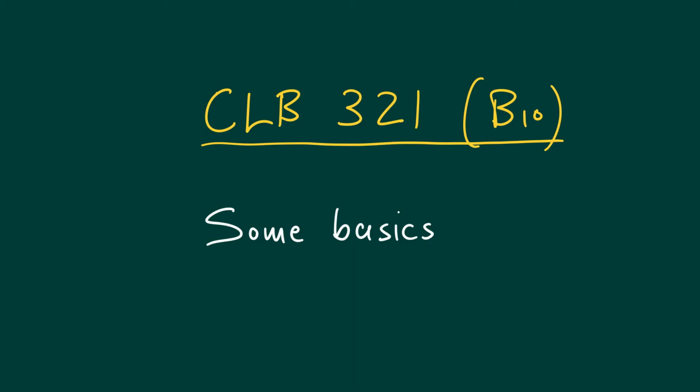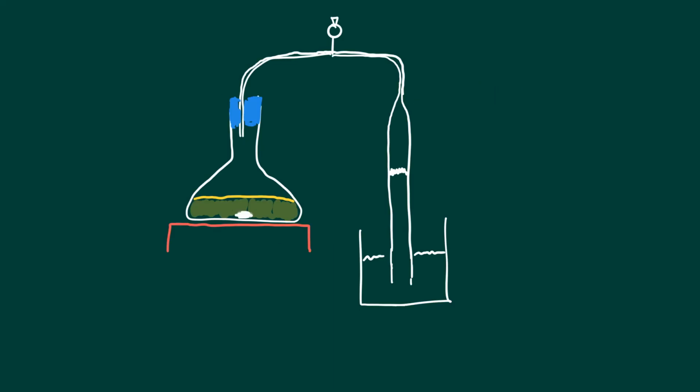Okay guys, just a short video. Some things are easier drawn than typed out in text. So this is going to be a real fun experiment. You are going to throw in, and this is important to realize, real living organisms into your broth or medium that you prepare.